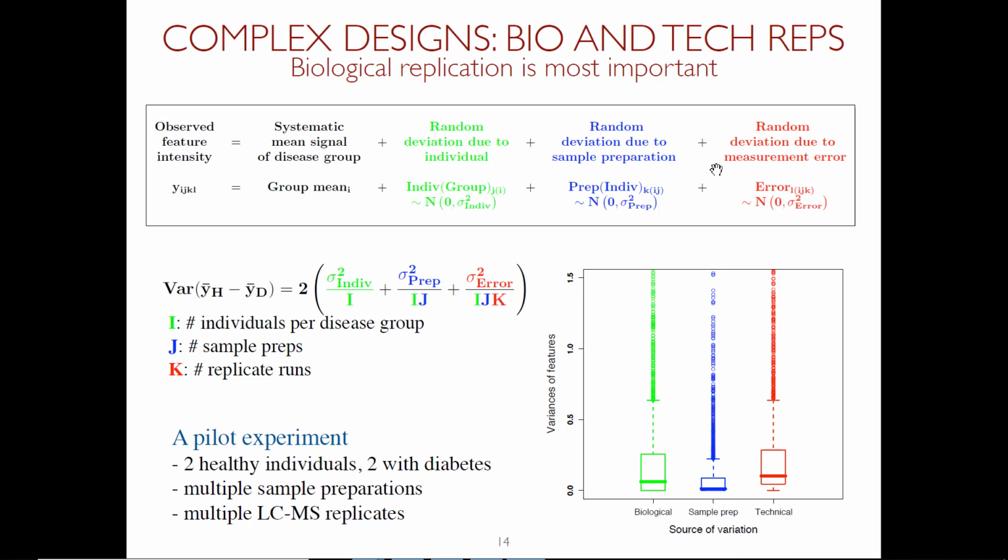And then MSstats can fix that for me, because I don't know how to do that myself. Of course. So what we will do, and we'll discuss this next week, is talk about how we develop these models, specifically for cases when we have many features per protein, outliers, and missing values. We will do all of that. The motivation is that in MSstats we're taking these classical statistics and upgrading them in a way, to be able to handle all of these issues.